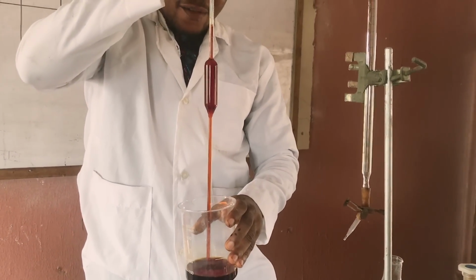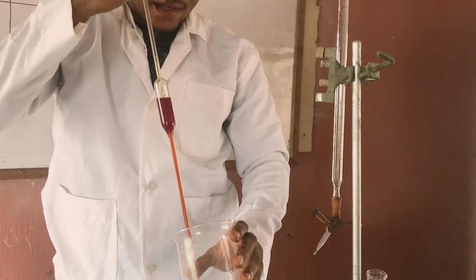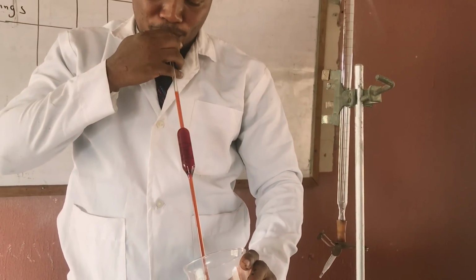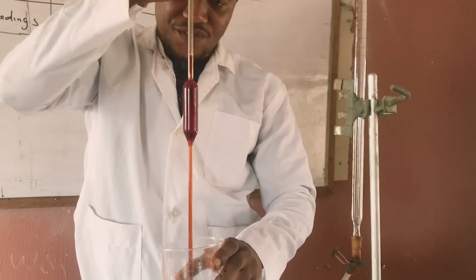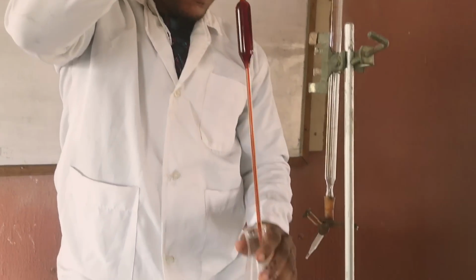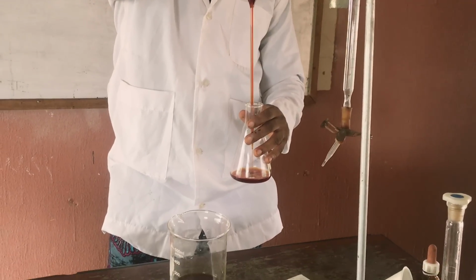I need 25 of these, so that it's free of bubbles. Okay? So I'm using a 25 centimeter cube pipette. Very good. Into my conical flask. Very important.